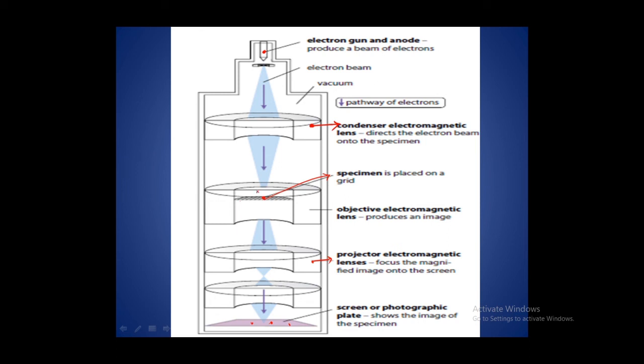Now we can increase the contrast using certain heavy metals as stains. Okay, because these heavy metals basically stop the pathway of electrons, and they create a better contrast. You will be able to see more densely stained parts using these metal atoms.